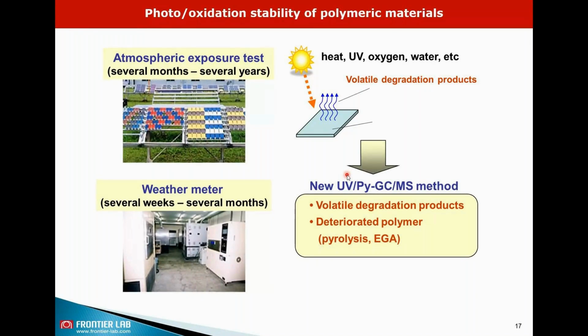Okay, so basically people wanted to do these two types of measurements. One is analyze the volatiles that are released due to degradation during this light exposure, and also look at the material integrity after this.